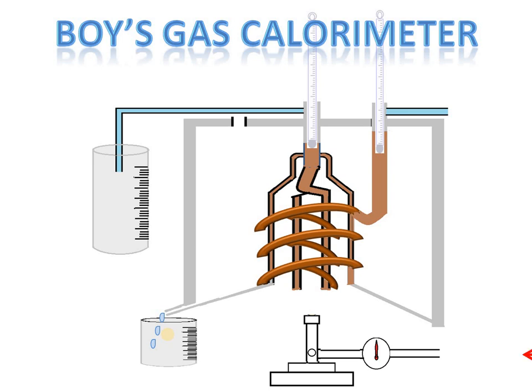First, allow the gaseous fuel to flow through the gas burner assembly. After that, ignite the fuel and, by using the pressure meter provided with the gas burner assembly, adjust the combustion rate of gaseous fuel. Further, allow the water to enter into the system.